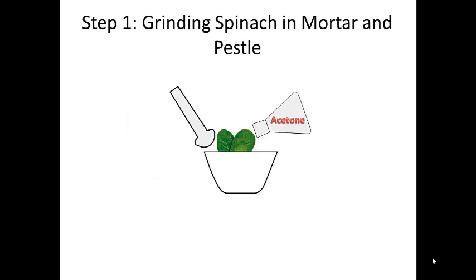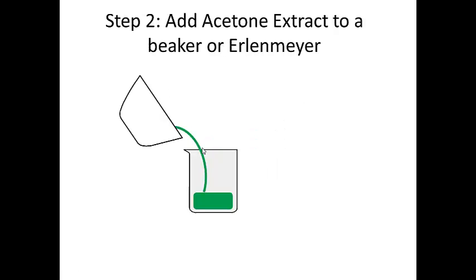The first thing we have to do is grind up the spinach in a mortar and pestle. We take the spinach, add it to a mortar and pestle, add acetone to it, and just grind it up. I'm going to take care of this part and then I'll give you some of the acetone layer for step 2.